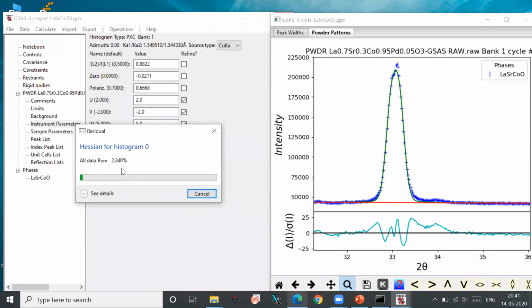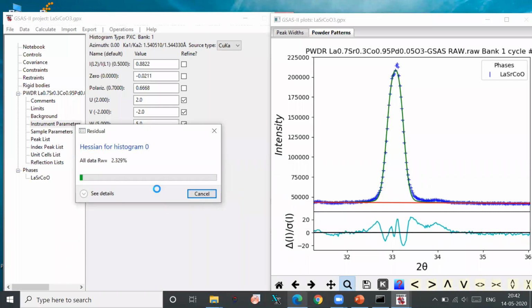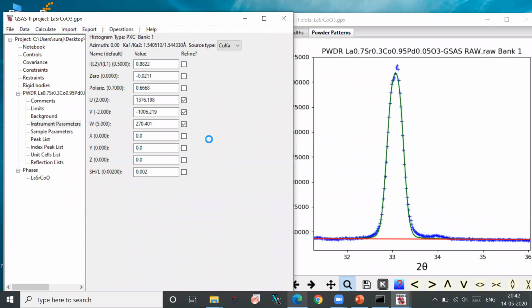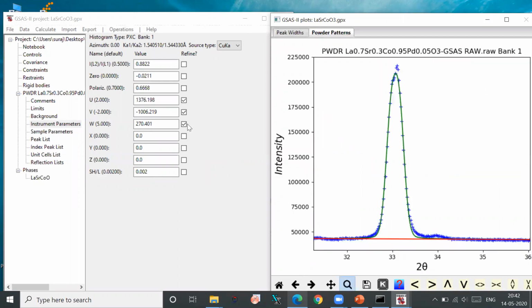So now see, it has gone down significantly. These are basically the pseudo-Voigt shapes. These are not purely Lorentzian or Gaussian. Yeah, definitely, and it is important. So the simulation is based on the pseudo-Voigt function, not predominantly Gaussian or Lorentzian type. So it's a mixed Gaussian and Lorentzian. You can see from here there is a mixed Gaussian and Lorentzian factor. It is a pseudo-Voigt type, and that is fair enough for doing the powder refinement.